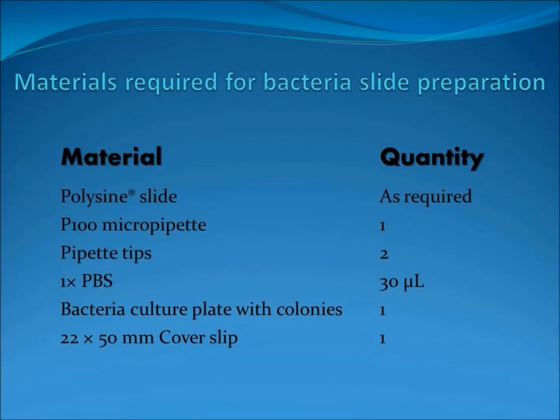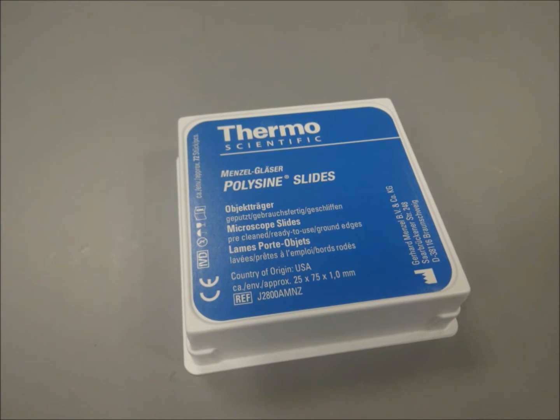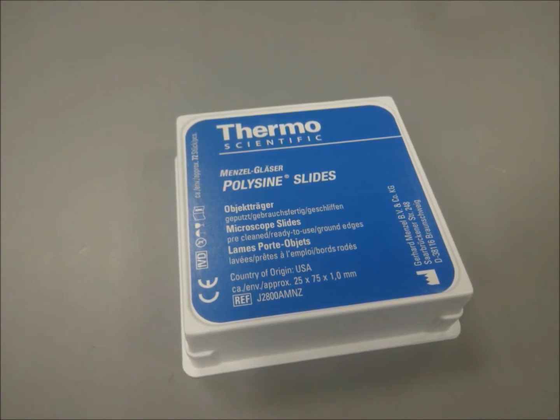This video will demonstrate the preparation of bacteria cells on a microscope slide for viewing. Glass slides coated with poly-L lysine will be used. Poly-L lysine is a positively charged amino acid polymer.